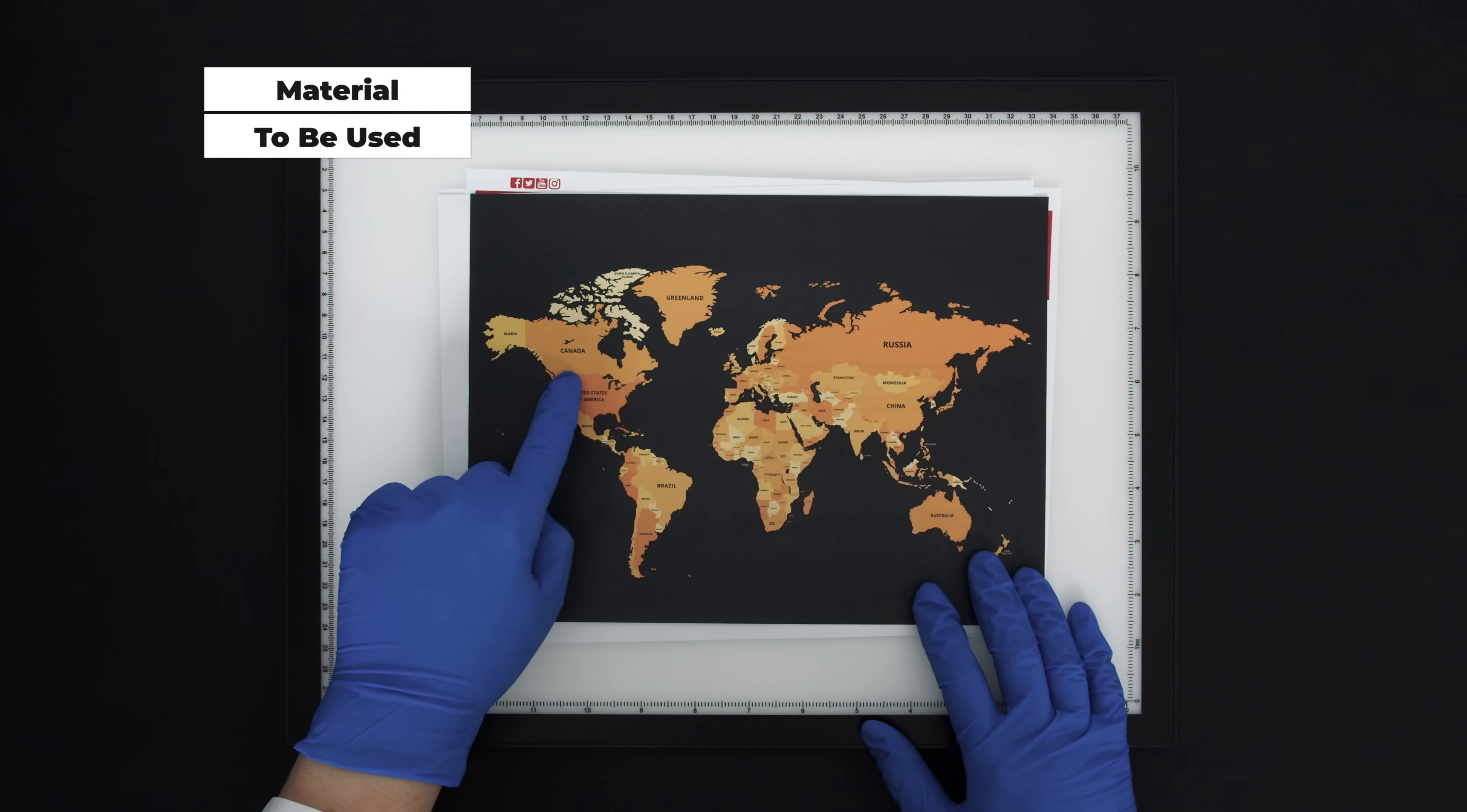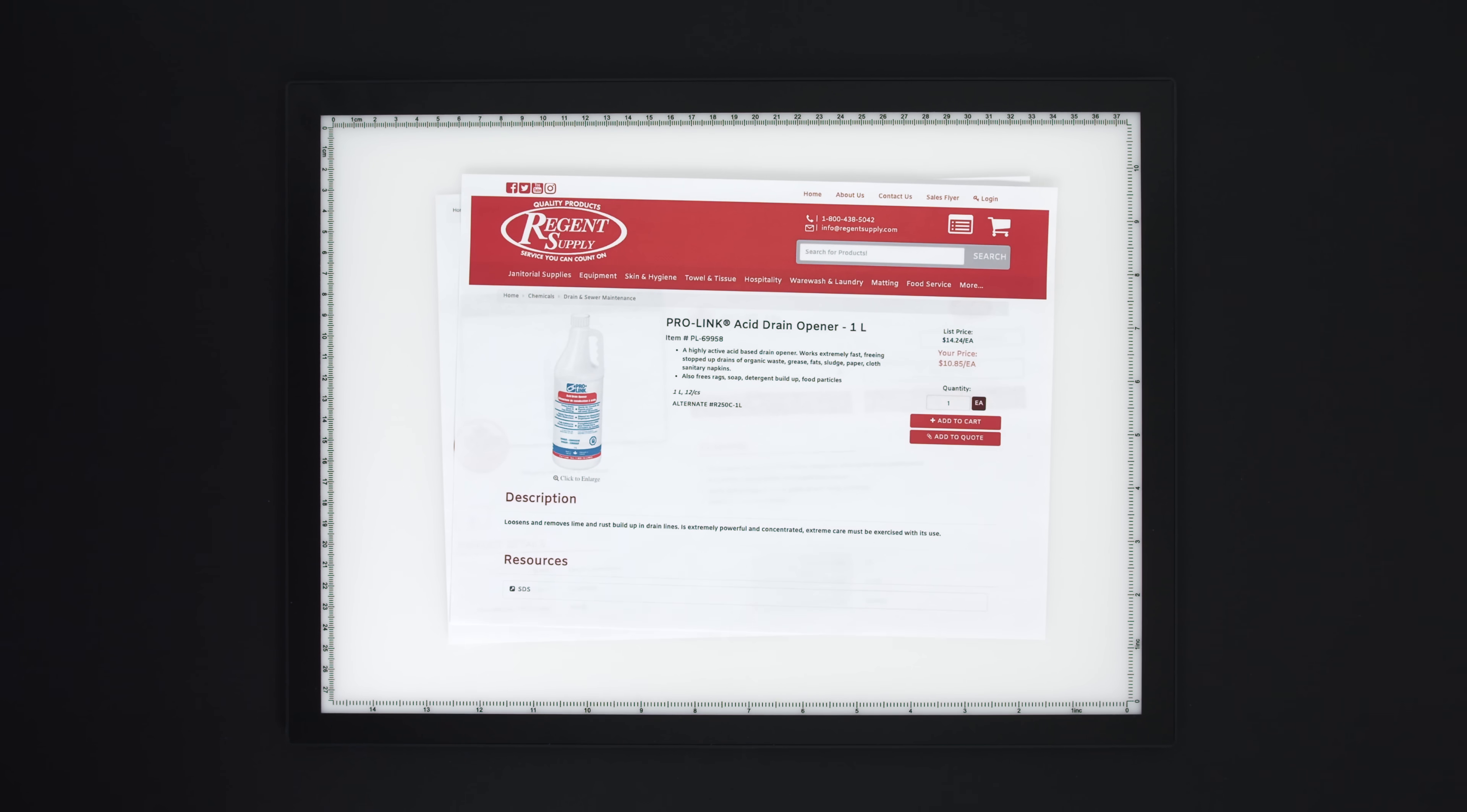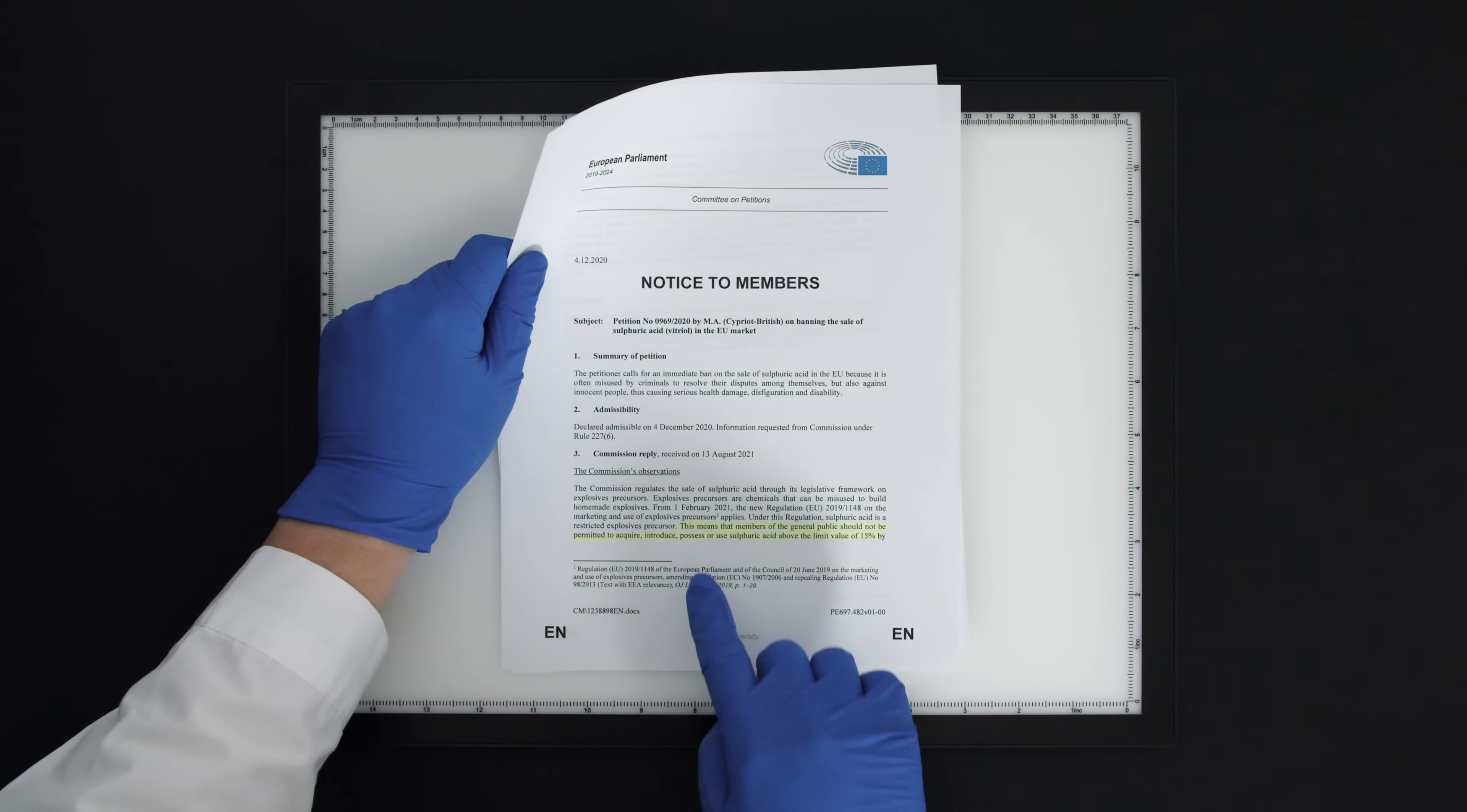In some countries, particularly in North America, sulfuric acid is commonly available as an acidic drain opener, which contains mostly 90-93% sulfuric acid and some inhibitors. So it is one of the easiest OTC sources of sulfuric acid. While you can use it directly for some reactions, you might want to purify it if you need its pure form or higher concentration.